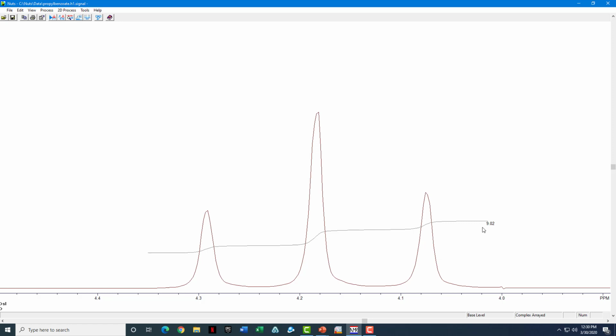Over the course of an experiment, there can be slight changes in the magnetic field, and so peaks get a little broader. Instead of staying tight and narrow, they get a little broader. And so for almost all data processing of T1s and T2s and other kinds of experiments like that, we don't use peak heights to process data. We always look at integrations. They're always more accurate than peak heights.